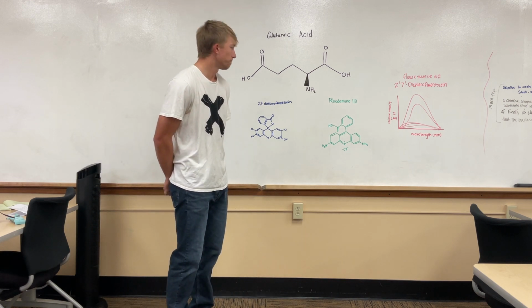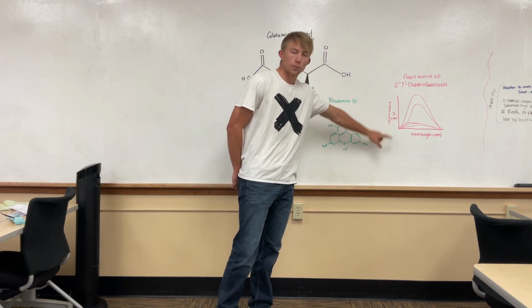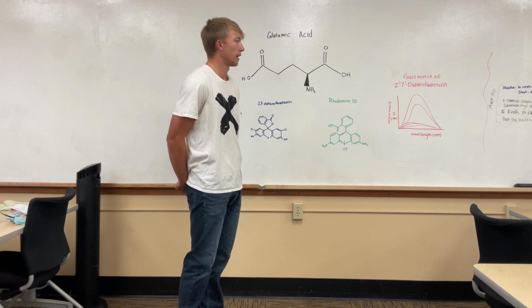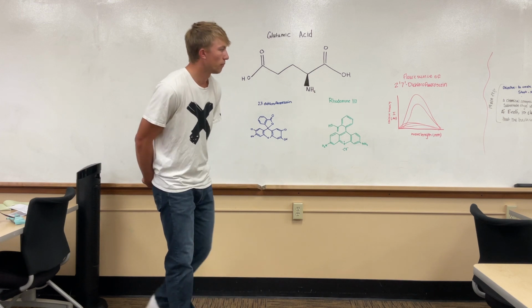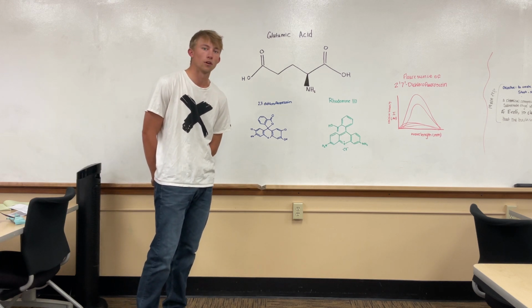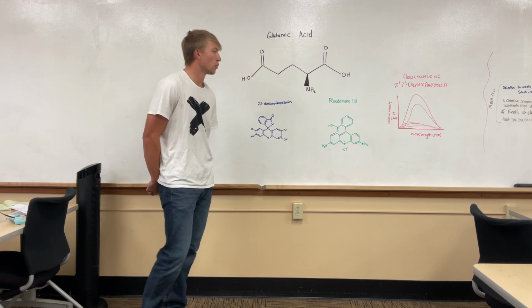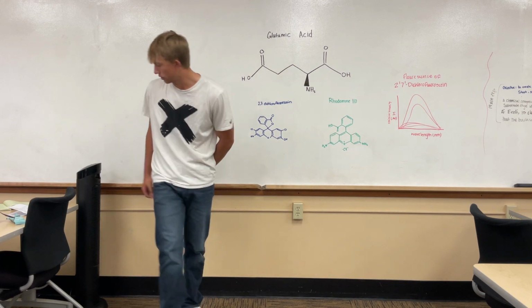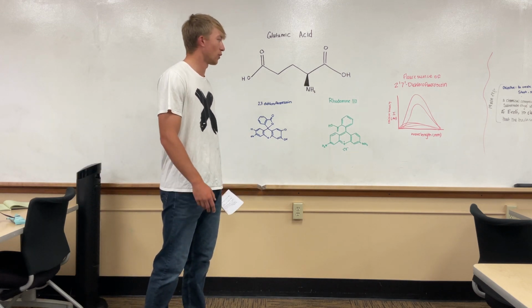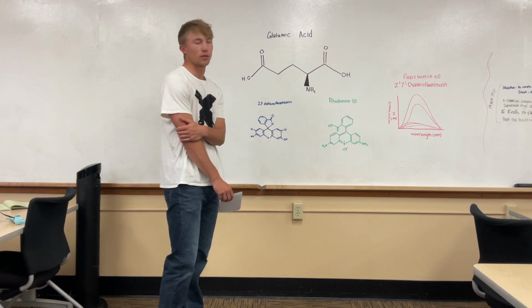We also found, when interpreting the graphs, that it was quenched more, and that was reflected in our data as well. We also found that it wasn't necessary for there to be a primary amine group for our indicator dyes. We also just want to make sure you don't pick a pH indicating dye, which is what we did with Congo red.